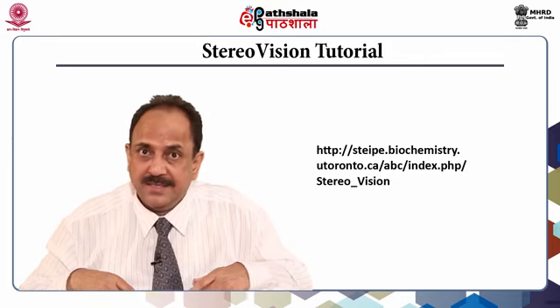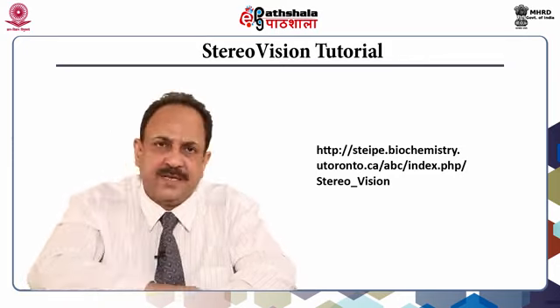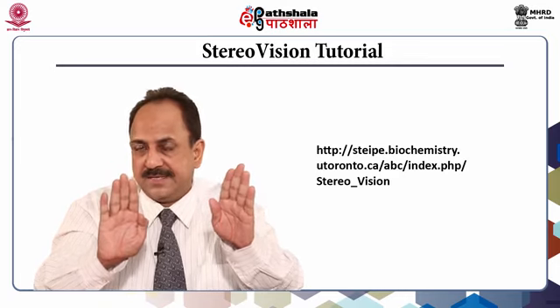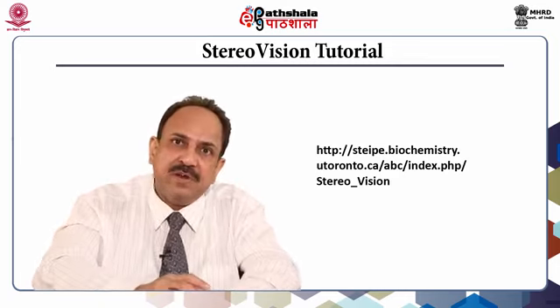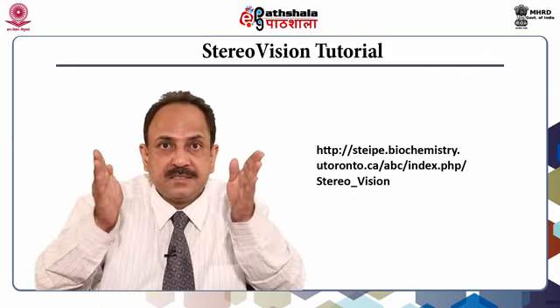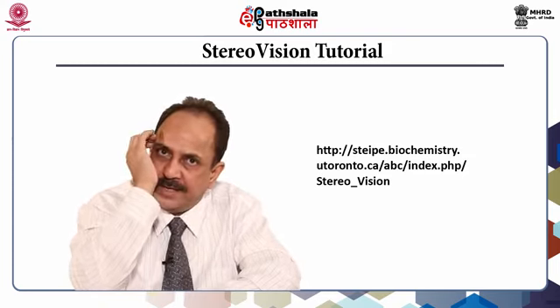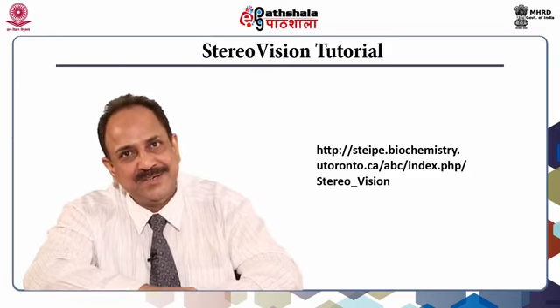So try this focusing, and once you focus at the farthest plane and the objects in between are duplicated, and if we have stereo vision objects, two images, one for each eye, then you will find that the middle two images slightly come closer to each other and overlap. Once they overlap, our brain is able to make out the depth of the molecule. So try this.